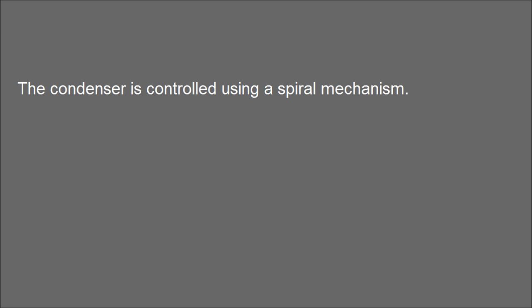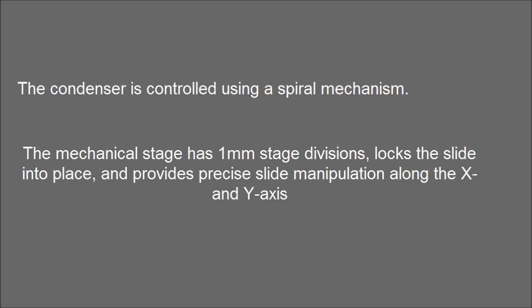The condenser is controlled using a spiral mechanism. The mechanical stage has 1mm stage divisions, locks the slide into place, and provides precise slide manipulation along the X and Y axes to allow coordinates to be recorded.